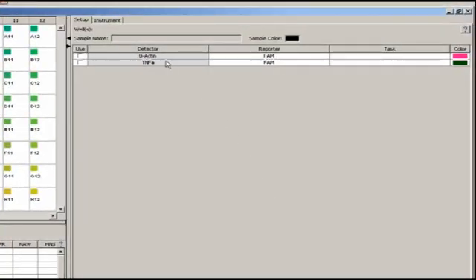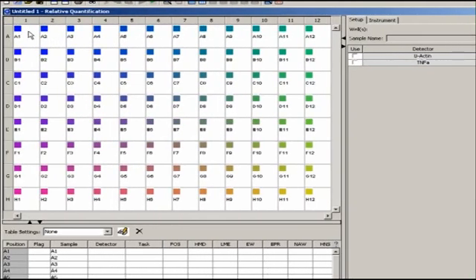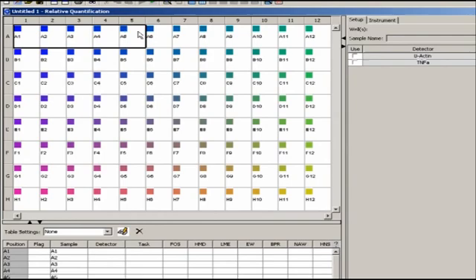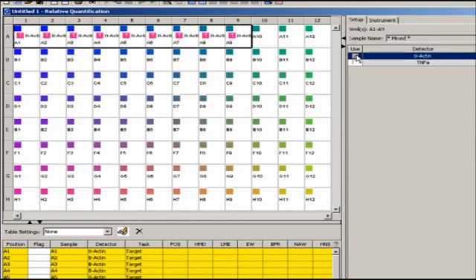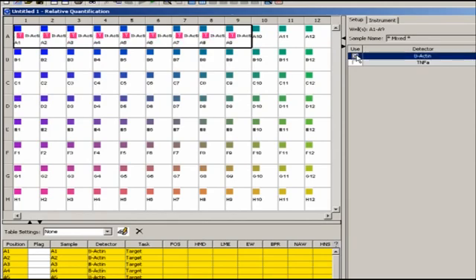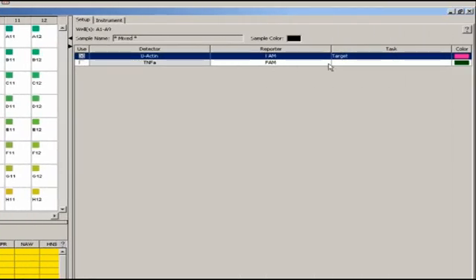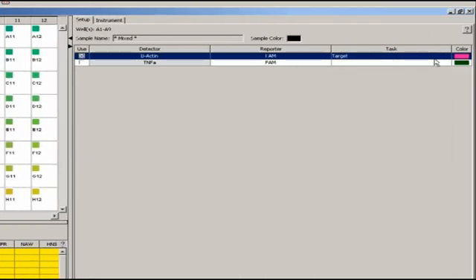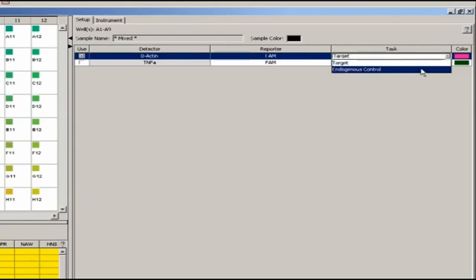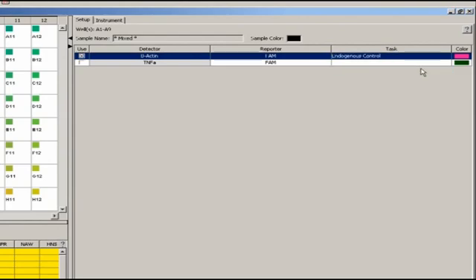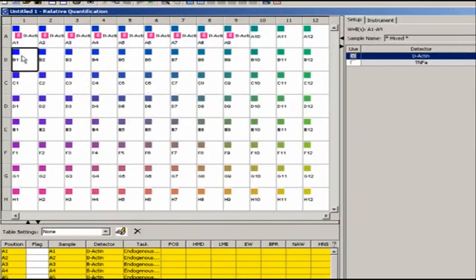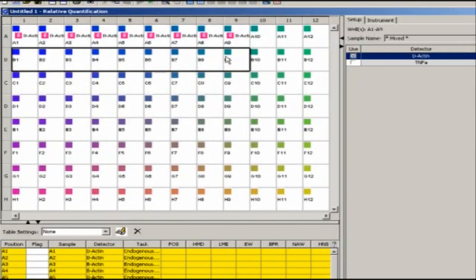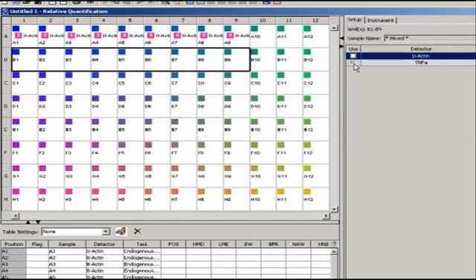I now need to add these to their correct spots on the plate map to the left. Select the wells that contain Beta Actin, and then go back to the detector list and click the Use box next to that gene. Beta Actin is now assigned to those wells. And even though we'll be labeling this information later in Data Assist, just note that you can designate your endogenous control here under the task pull-down menu. Select the wells with TNF-alpha and click its Use box.